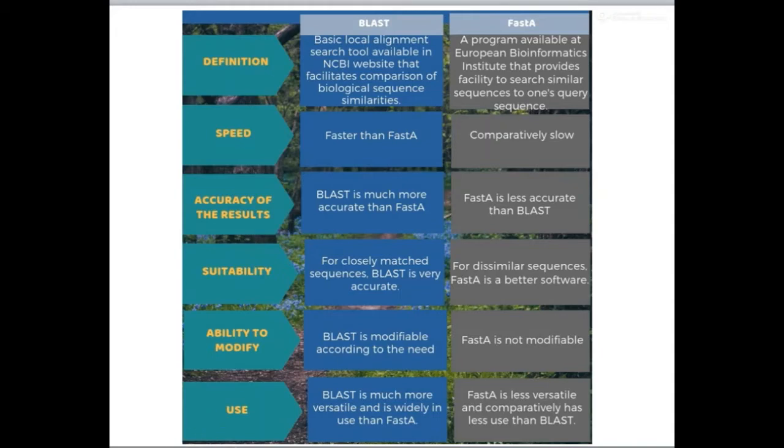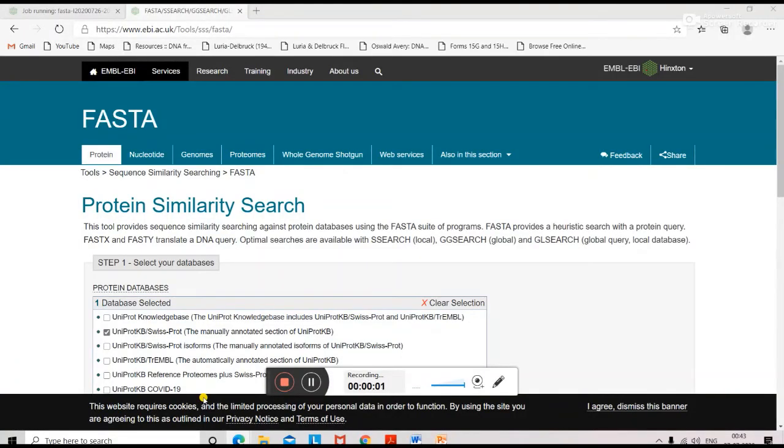Now I think I can just take you to a link of the FASTA result for your reference, and thereafter, I think it's better that we go through the site and see how FASTA looks. Now let's explore how to do the FASTA. This has mainly been provided by the European Bioinformatics Institute, and it has been linked to EMBL, and that's why I had mentioned EMBL earlier.